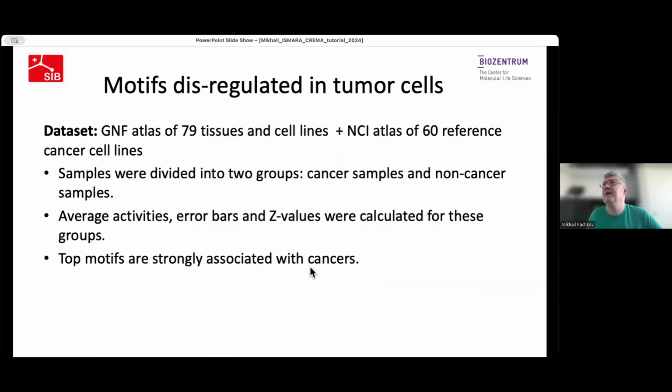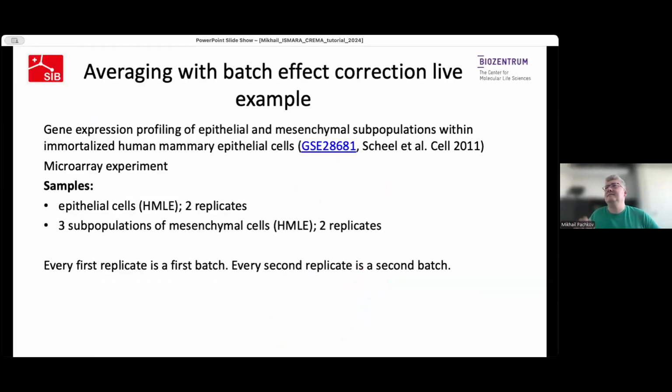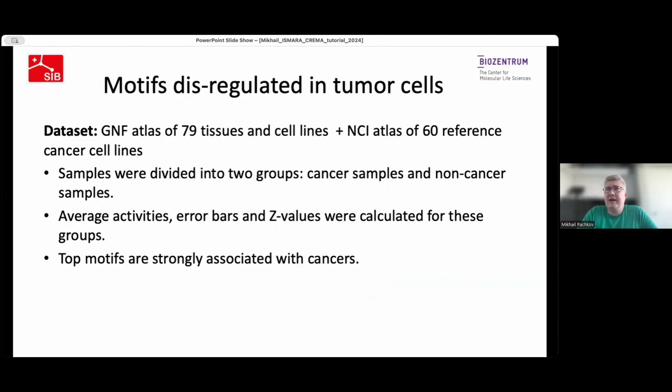Okay, and the last thing to show is how to use the results of averaging between different cell types.